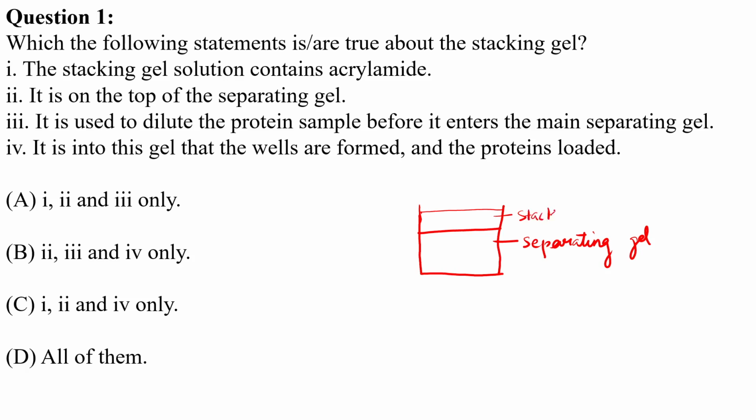So stacking gel is present on top of the separating gel. So that is a correct statement, right? And it is used to dilute the protein samples before it enters the main separating gel. Is this statement true or false?